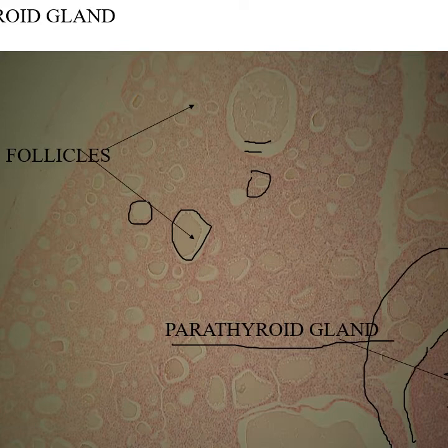And it secretes, surprisingly enough, parathyroid hormone, which is antagonistic to calcitonin. Parathyroid hormone will raise blood calcium levels, which is actually a little more critical. Low blood calcium, your heart quits, your nervous system quits, which tends to be kind of detrimental. So a parathyroid gland, you got 4 of them. There's just one on this slide, and it secretes parathyroid hormone.